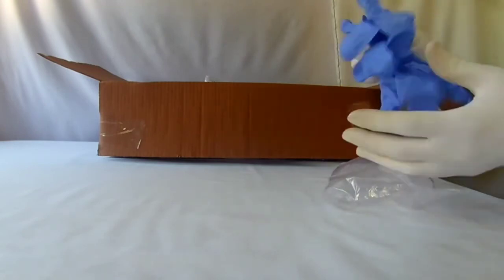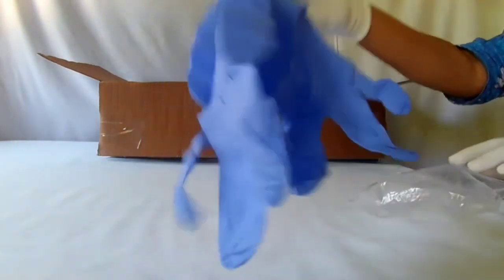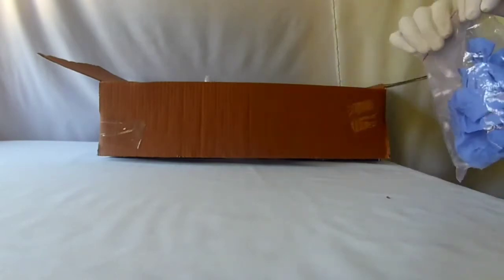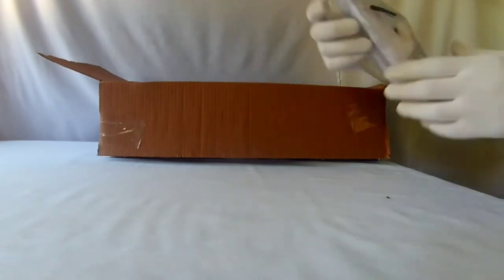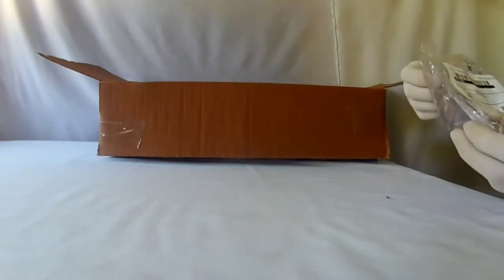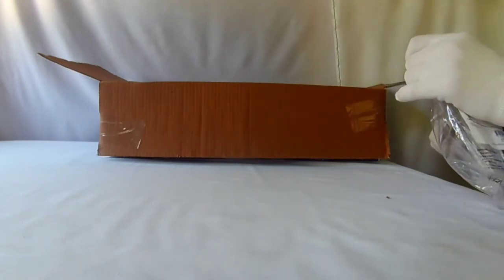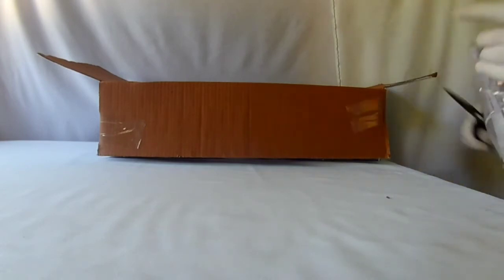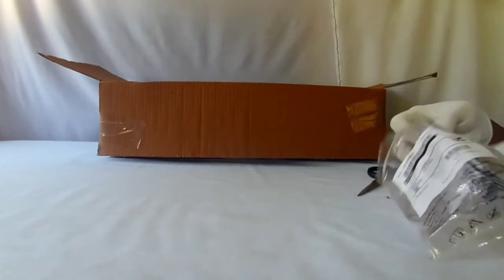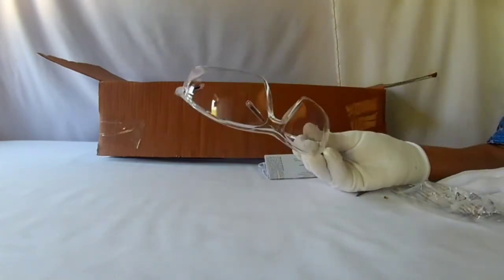A pair of gloves. Wear this for the protection of hand while conducting the experiment. Goggles. Very clear. Use this for eye protection during the activities.